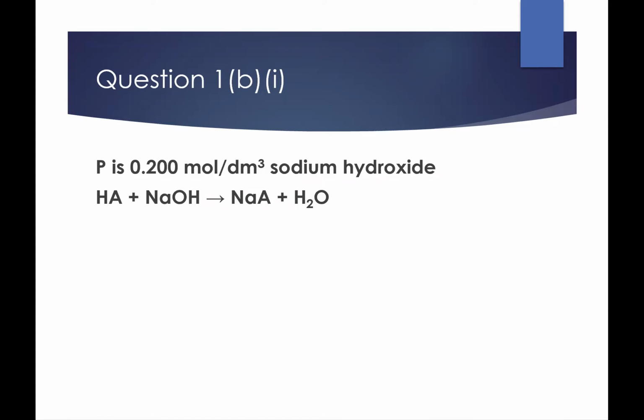So you use these 2 things to calculate the number of moles of the acid in 25 cm cube of Q. Now remember, this 25 cm cube is the one that you use your pipette to measure out.